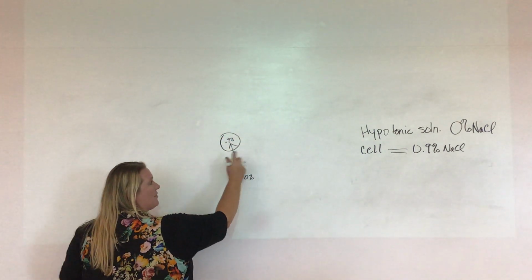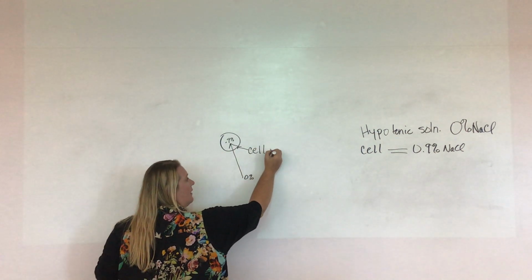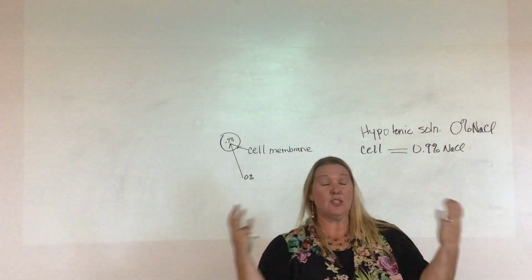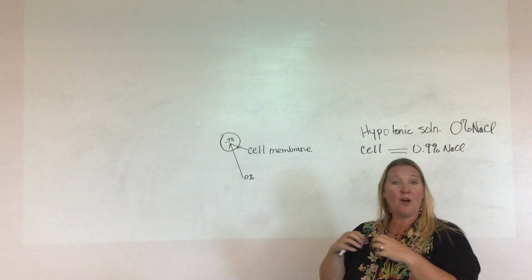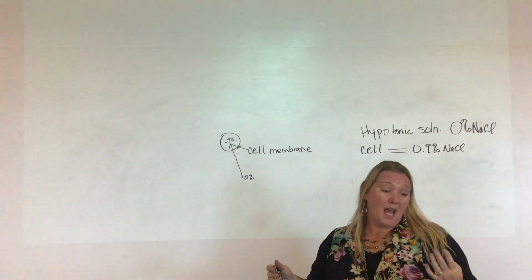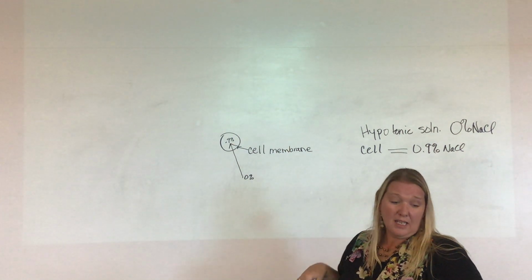Okay, so animal cells and their cell membrane can only withstand so much pressure until it's just too much, and then it busts. Okay, so those cells have all lysed, they've all broken open, right? And so when I said there might be some debris, some pieces of some cells, or maybe some that haven't broken yet, I could continue to look and look and look, and we wouldn't find any, right?